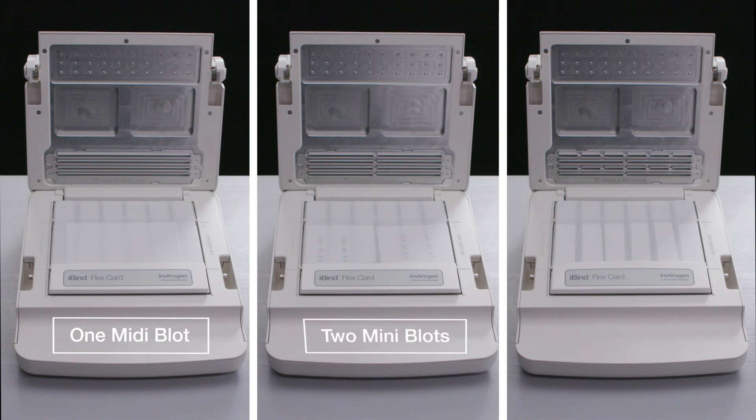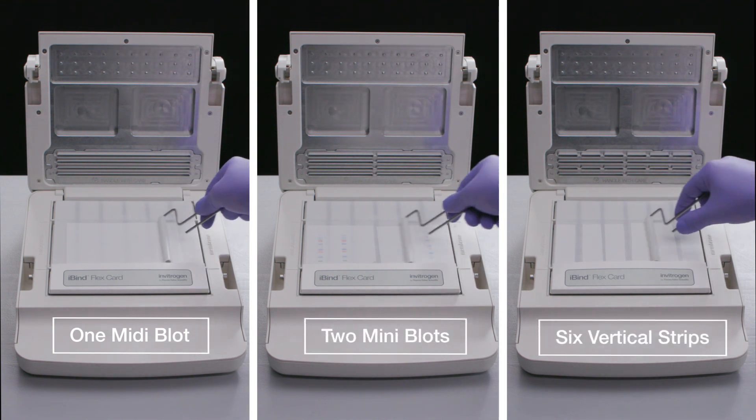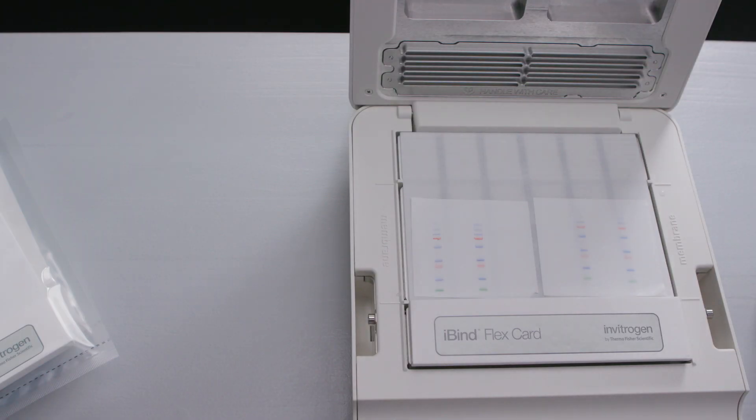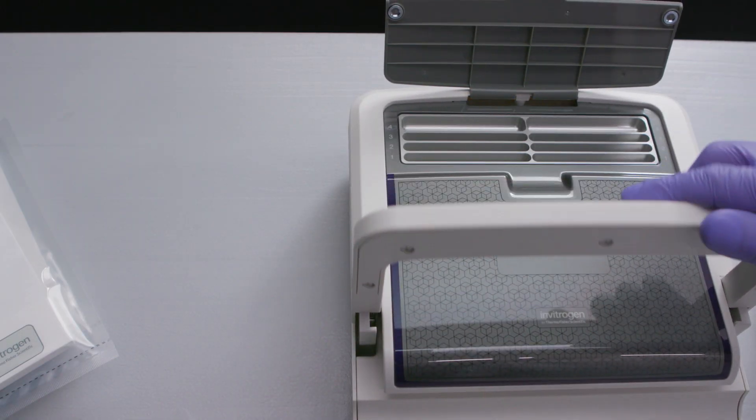Using the roller, firmly roll the membrane to remove any air bubbles and to ensure good contact between the membrane and the card. Close the lid and open the liquid door to expose the wells.